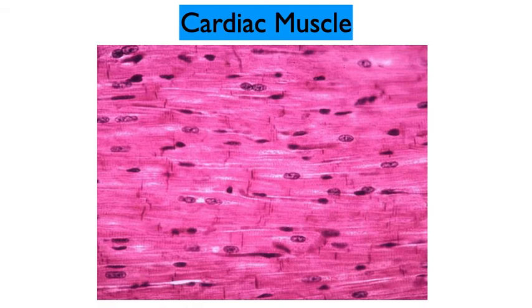In class, several times I've mentioned how we want these acting in unison. If you're thinking of your left ventricle, which is the chamber of the heart that's going to pump the bulk of the blood through your entire circulatory system, we need them to act in unison. We want to empty that as much as we can to get a good volume of blood flowing. And you can see nuclei, but you can also see those little cross hatchings. Those are the intercalated discs that allow an action potential to travel from one fiber to the next so that we have that coordinated contraction that we desire. All right, so that's cardiac muscle.